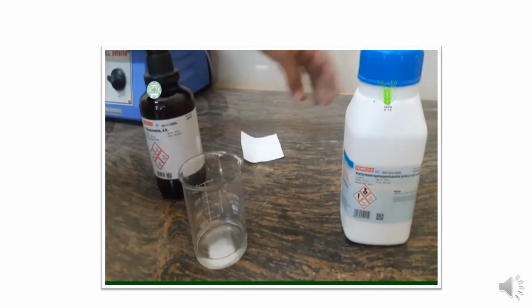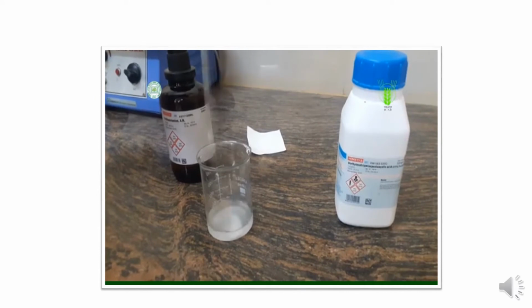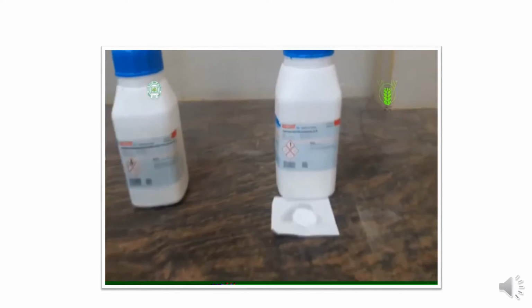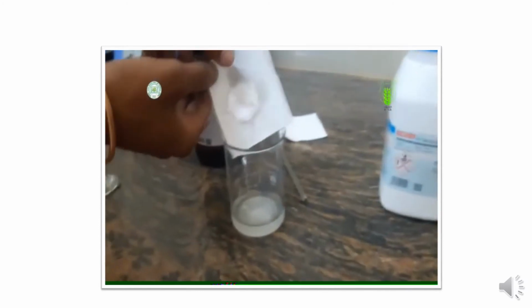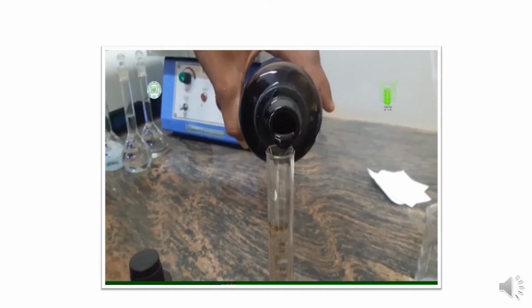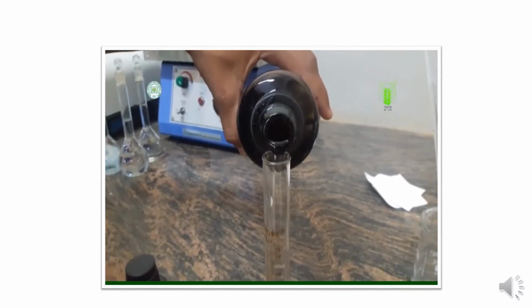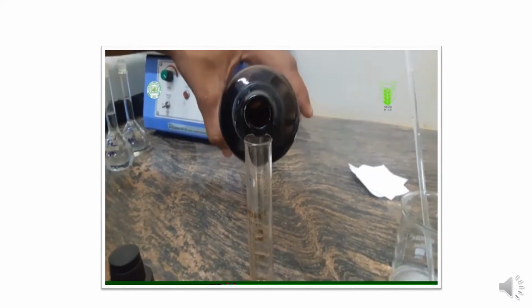Before starting the experiment we must run the atomic absorption spectrophotometer so it is ready for the analysis of different micronutrients. As I already mentioned, we also need different reagents to prepare the DTPA extraction solution.